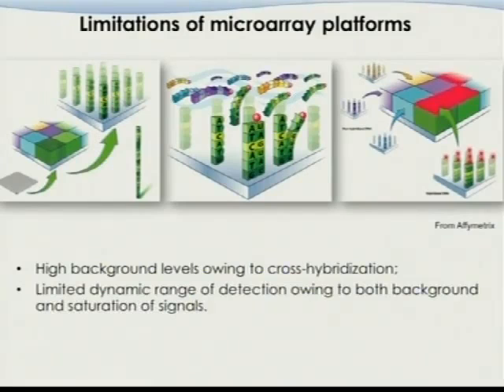However, arrays don't do very well for the high signal part as well. The reason for that is, once we do the detection and you count how many red hats are in each different compartment, if the gene expression level is really, really high, that part will already be saturated. Let's say GAPDH.